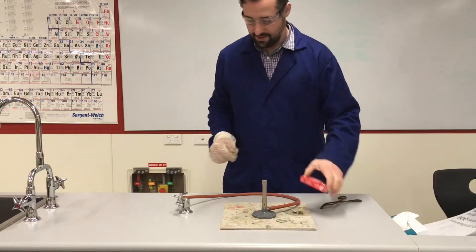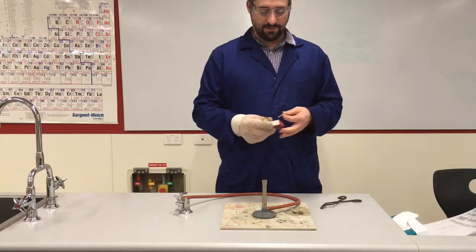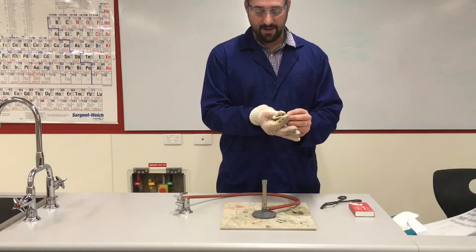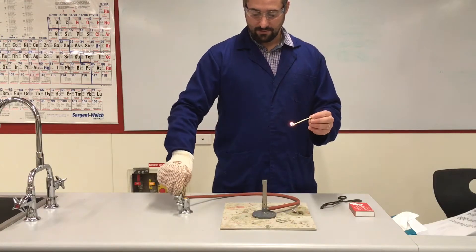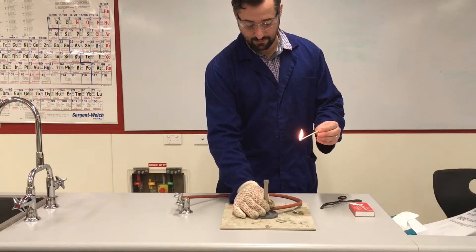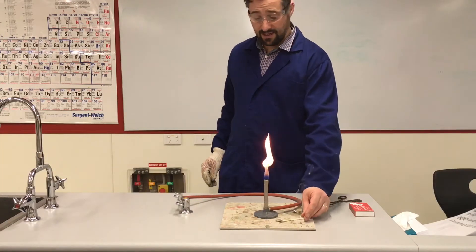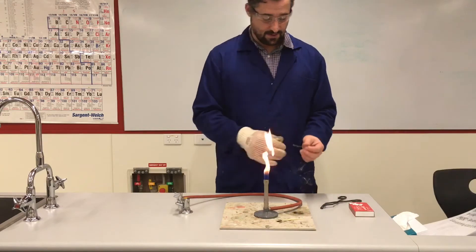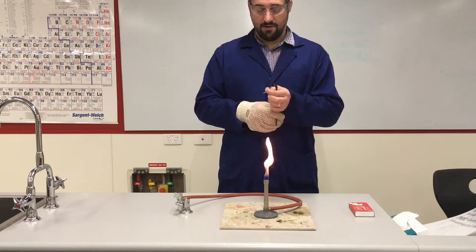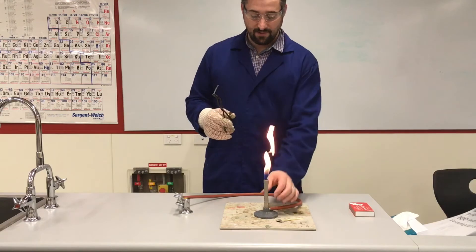This requires heat, so I'm going to use my heatproof glove. We're going to light the Bunsen burner with our match, turn on our gas, and always start on the safety flame. Now I've got my metal tongs and I am going to clamp my magnesium ribbon.